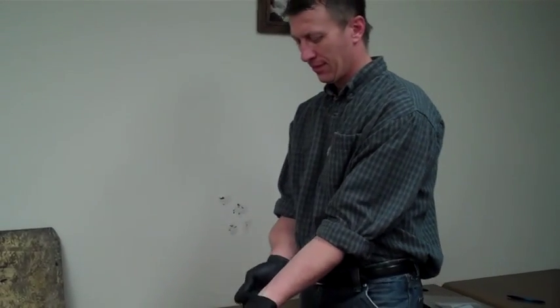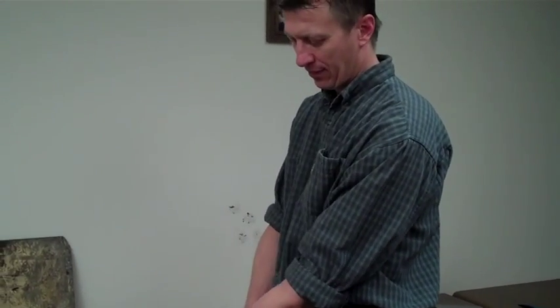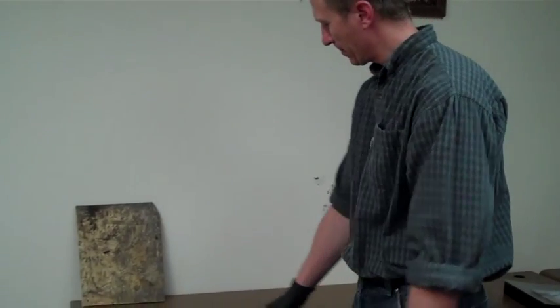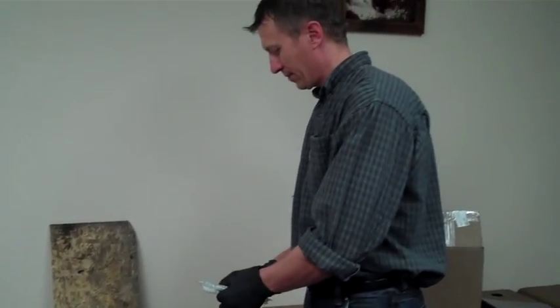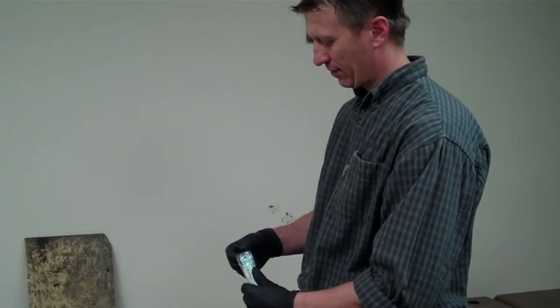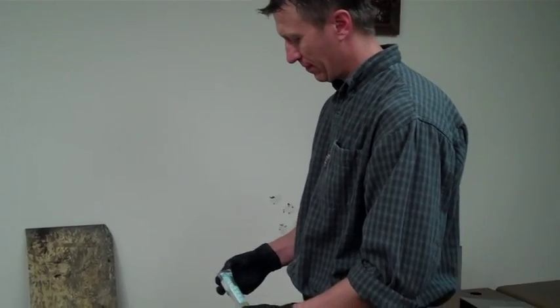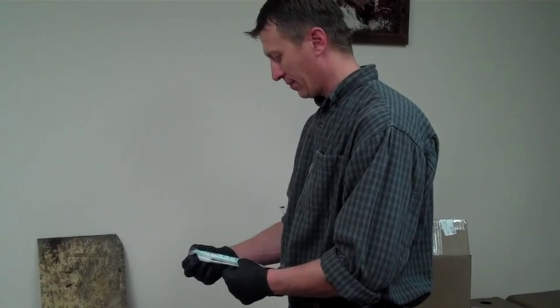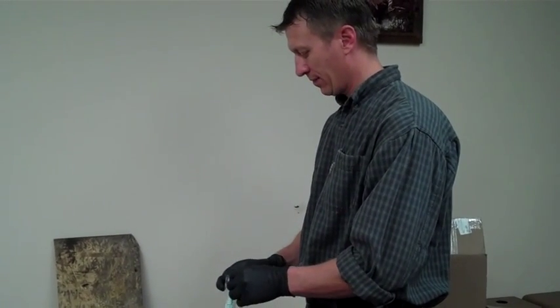Due to the many varying species, colors, textures, and growth formations of mold, there is just no way to determine the type of mold we are dealing with without proper sampling. Knowing the type of mold we are dealing with can mean the difference between expensive remediation and simple house cleaning techniques.